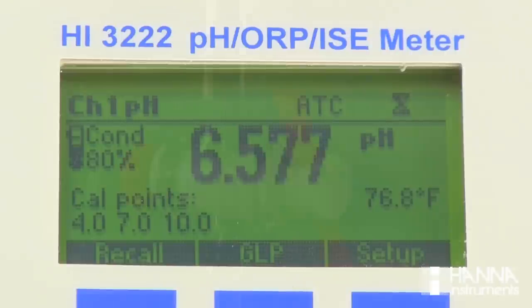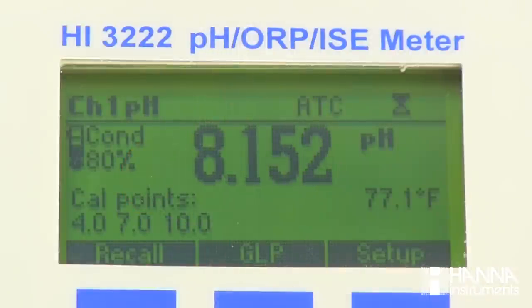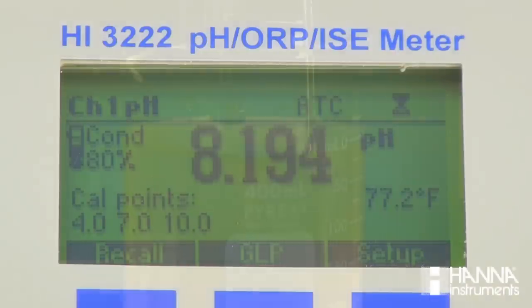Our pH begins to change more quickly with every titrant dose. At this point, we're going to begin to add smaller doses and wait for each titrant dose to completely react with the analyte before adding another dose. By doing this, we ensure that we're accurately detecting our endpoint and not overshooting it.